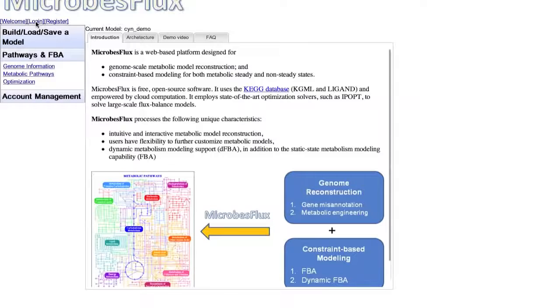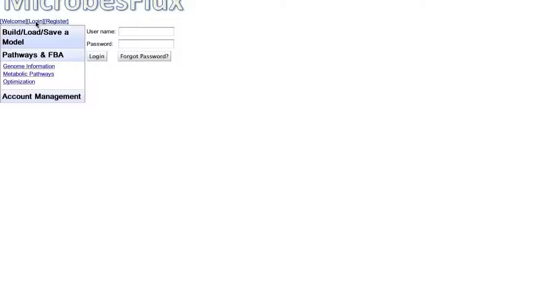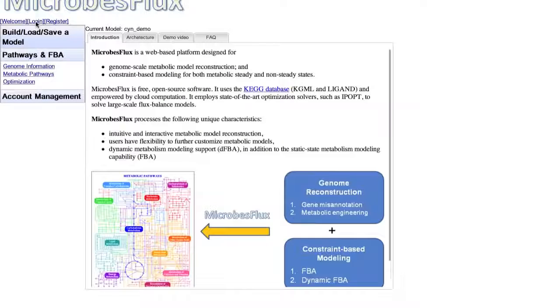Our MicrobesFlux system is open to everyone and free for academic use. We don't need to register or log in at all to use the features of the website. However, registered users can save their models for later access.